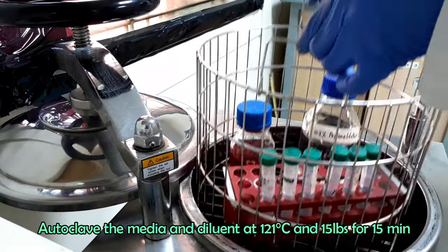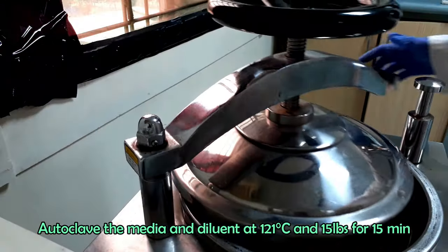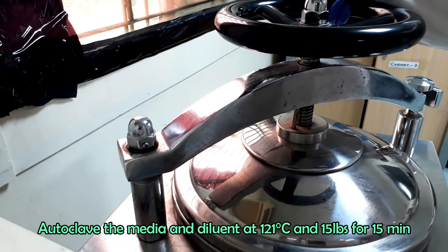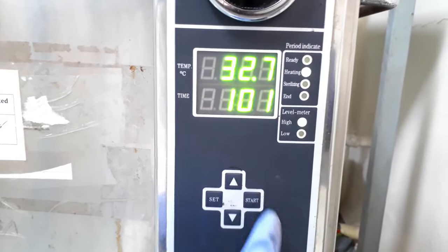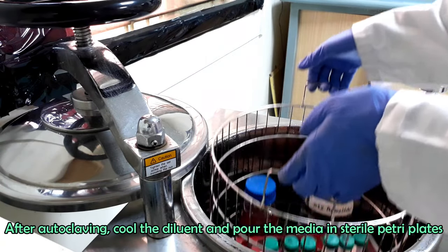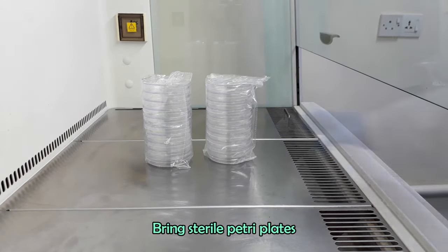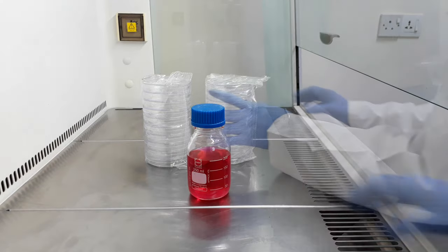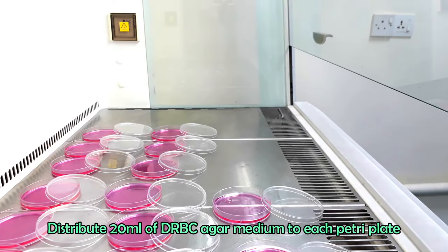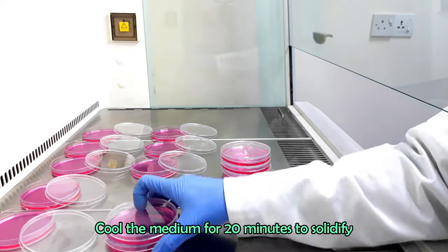Autoclave the diluent and media at 121 degrees Celsius temperature and 15 pounds pressure for 15 minutes. After autoclaving, distribute 20 ml of DRBC agar medium to each of the sterile petri plates. Cool the medium for 20 minutes to solidify.